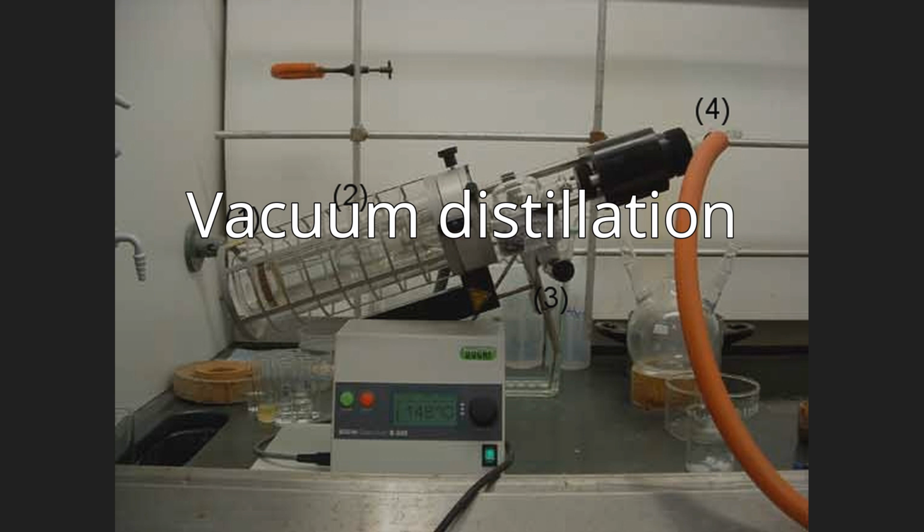Vacuum distillation. Vacuum distillation is distillation performed under reduced pressure, which allows the purification of compounds not readily distilled at ambient pressures or simply to save time or energy.